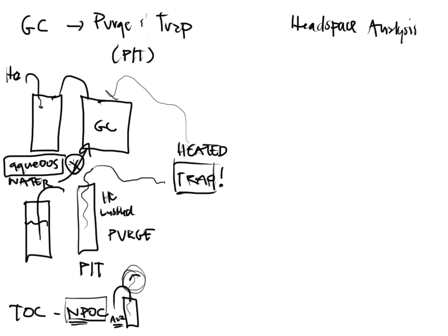That's what purge and trap is. Our purge and trap is actually attached to the GC-MS system. That's just how we decided to use our P&T system whenever we do decide to use it. We rarely use it, but we do have that option. So not a big deal there, but that's the purpose of the purge and trap.